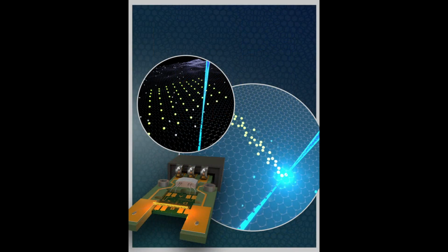In this manuscript, we lay out a vision for the future development of this instrument toward an expanded set of capabilities and applications. Specifically, we propose that the incorporation of in situ synthesis techniques will complement and amplify current atomic fabrication capabilities to facilitate the development of atomic scale manufacturing.